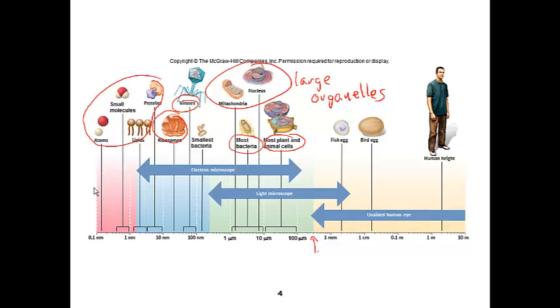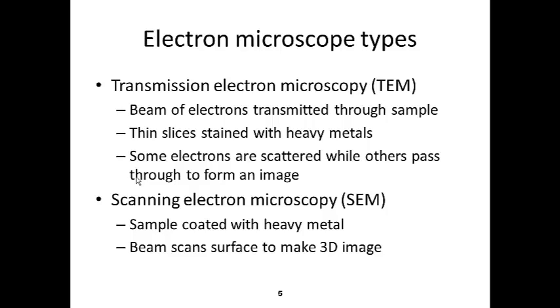Notice though, the electron microscope does not have atomic resolution. There are actually now current microscopes that allow us to get that low on the resolution scale, atomic force microscopes. So what microscope will you choose to use? Well, it depends on how small the object is. For most cells, the light microscope is fine. For particles like viruses, for organelles, intracellular particles like ribosomes, and macromolecules like proteins, we require an electron microscope to make out the details.